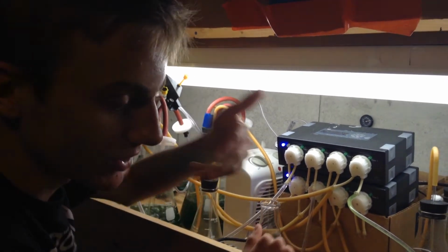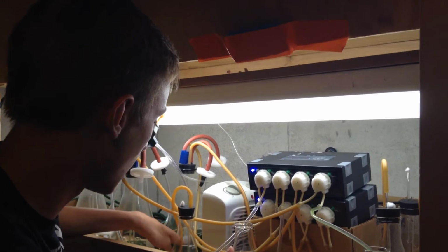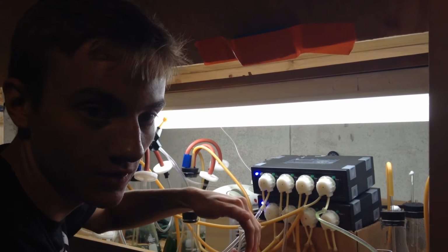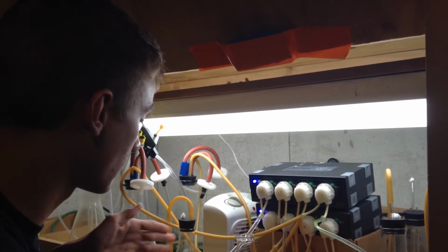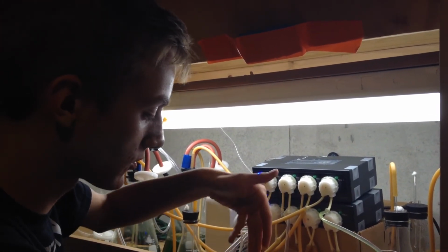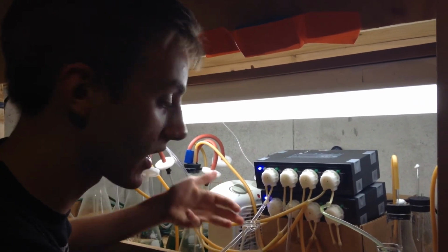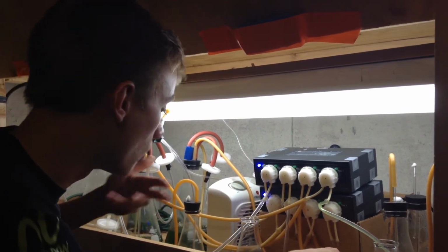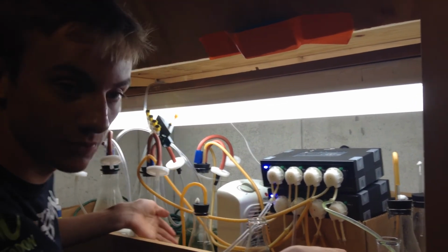And then I will increase the dilution rate, and then eventually at each dilution rate, the algae will reach some constant concentration where they're growing at the same rate the culture is being diluted, and that will represent a different degree of nitrogen limitation. So by changing the dilution rates and measuring the lipid contents of the samples, I'm measuring the lipid contents at different nitrogen limitation rates. And I can do the same kinds of tests with phosphorus, potassium, and sulfur and find out what the best conditions to grow the algae are using this type of experimentation.